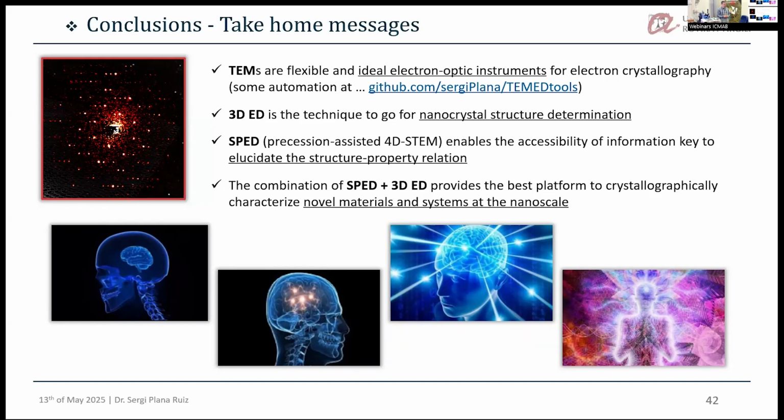It's true. One thing that you could do, if you see that it's a big crystal, is just scan the beam into different areas of your crystal. So there are different possibilities in order to solve this kind of material. But now the preference is to look for different small crystals instead of looking at a big one, different zones. Yes, I would say so. Thank you.